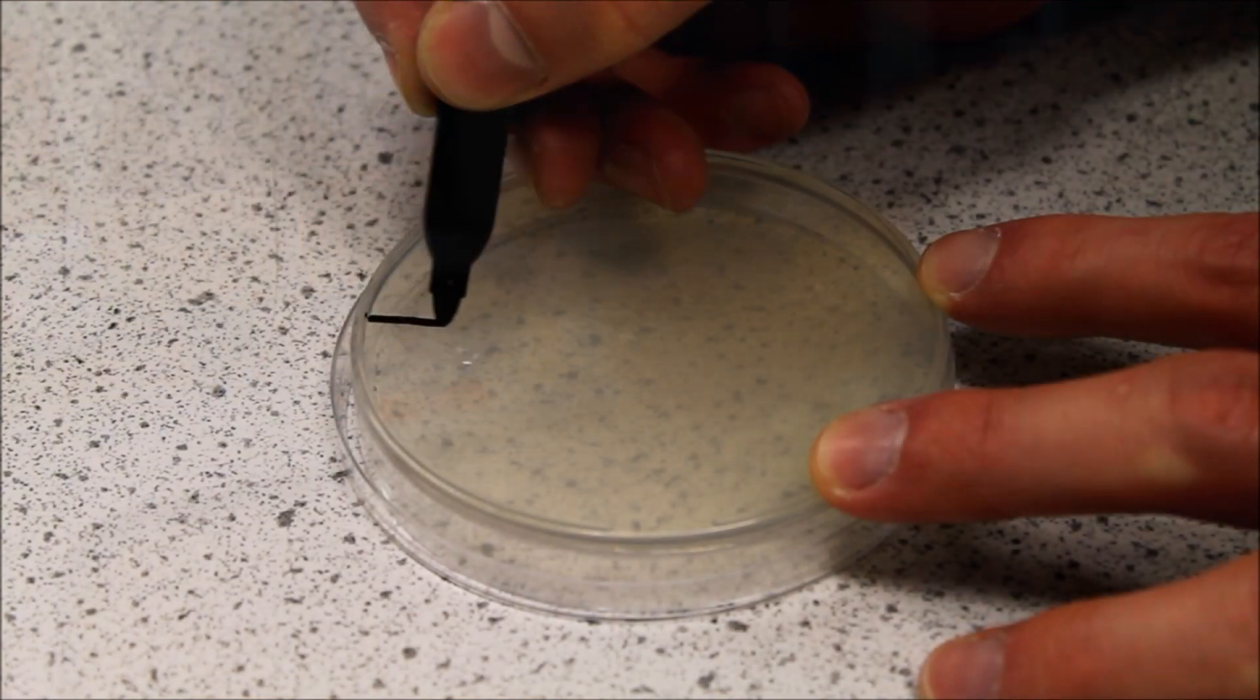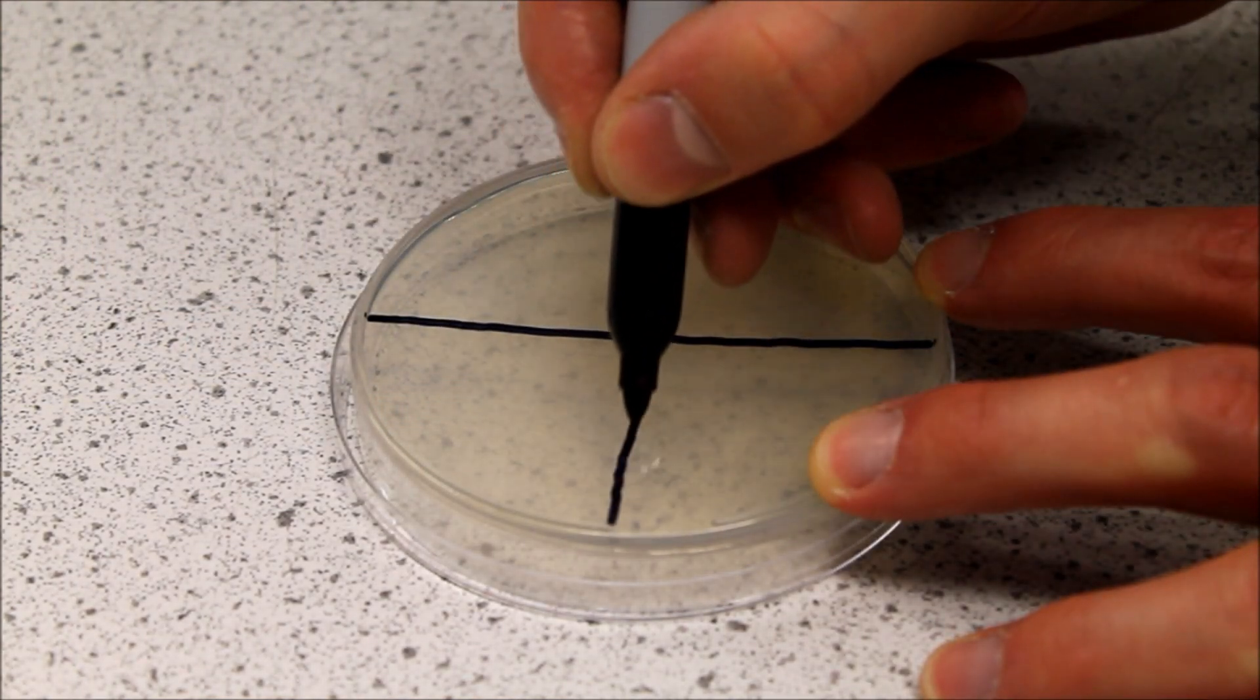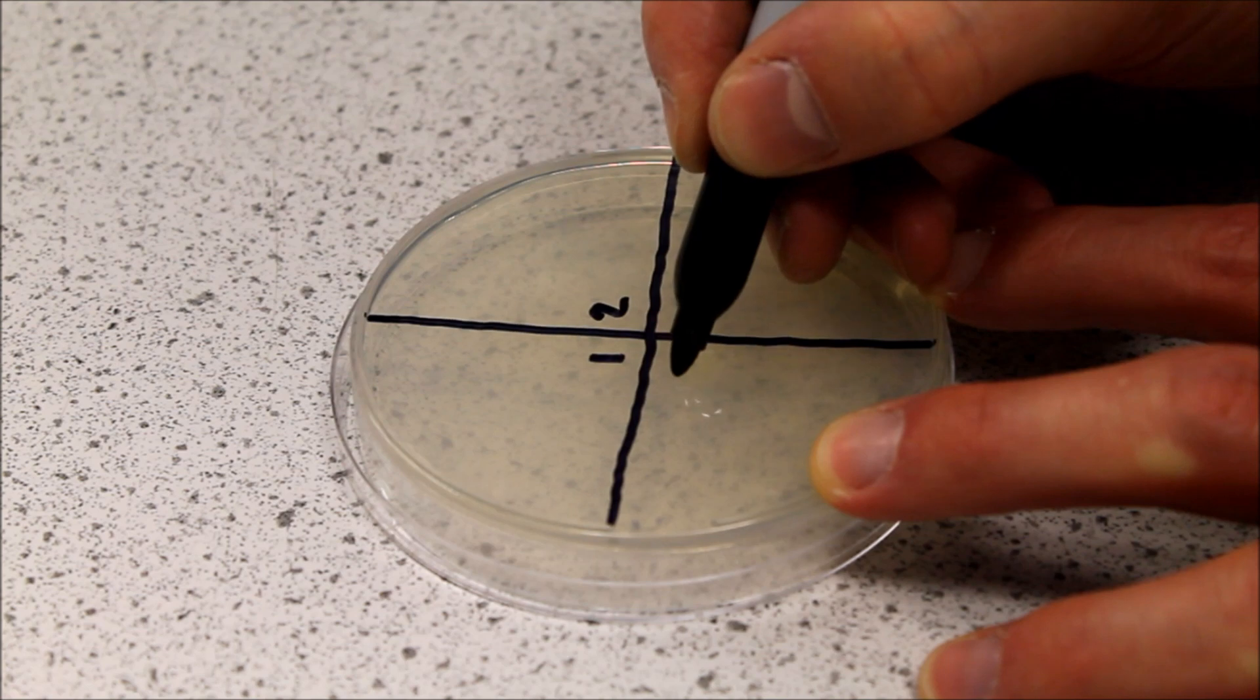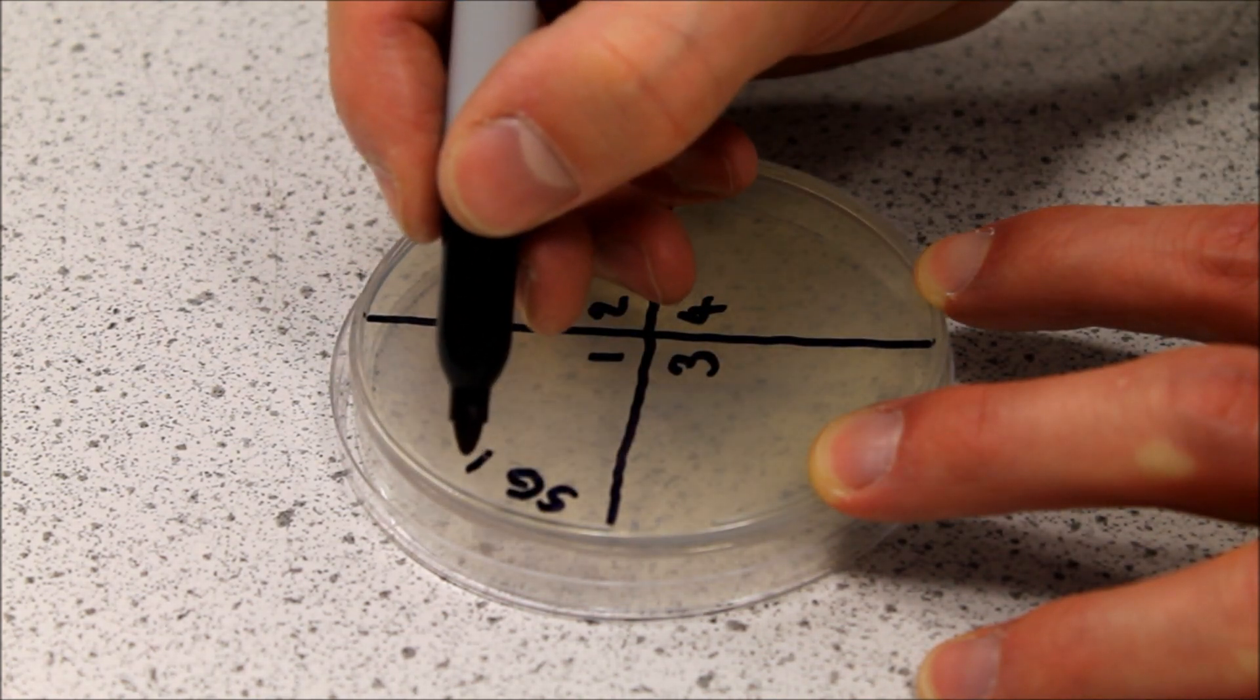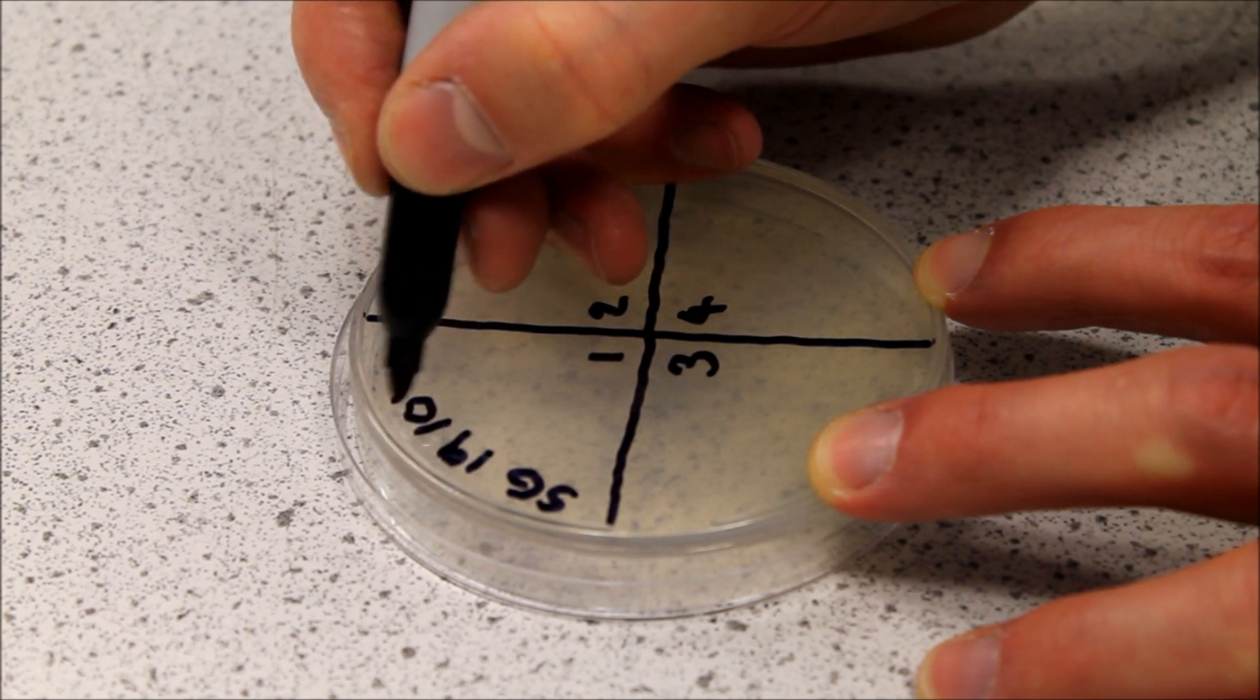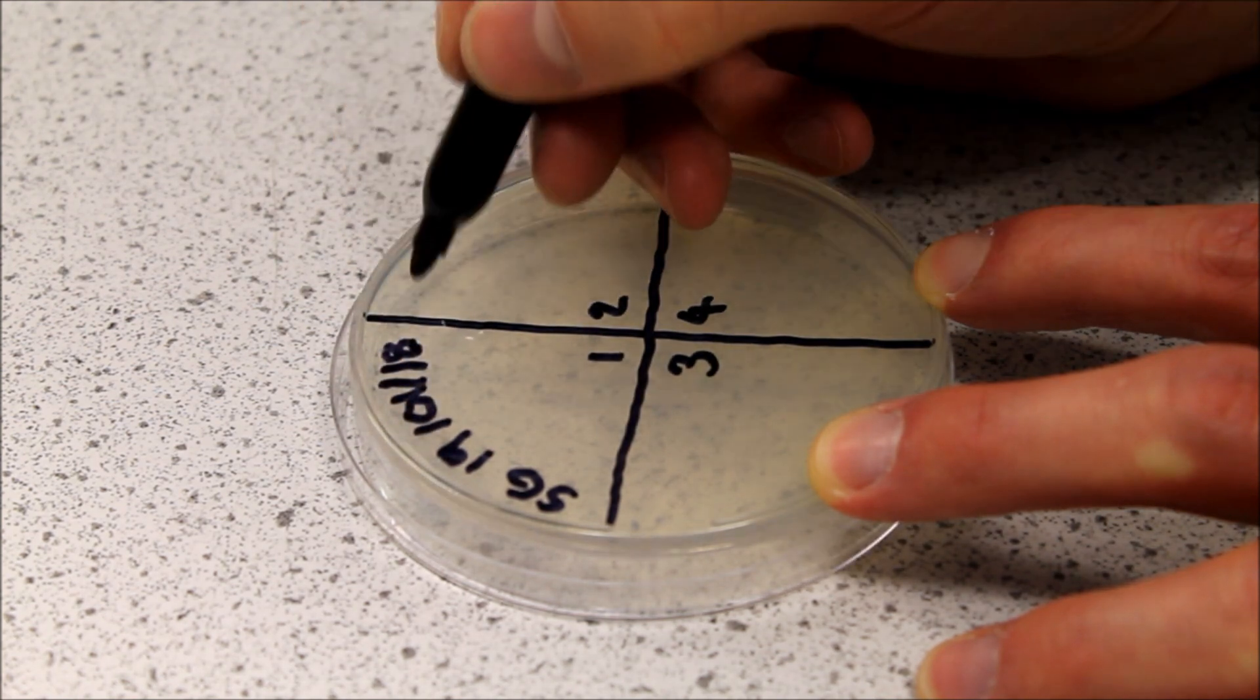Using the marker pen, divide the bottom of the agar plate into quarters and number them 1 to 4. Also write your initials, today's date and the name of the bacterium around the outside of the plate. Make sure the lid stays in place to avoid contamination.